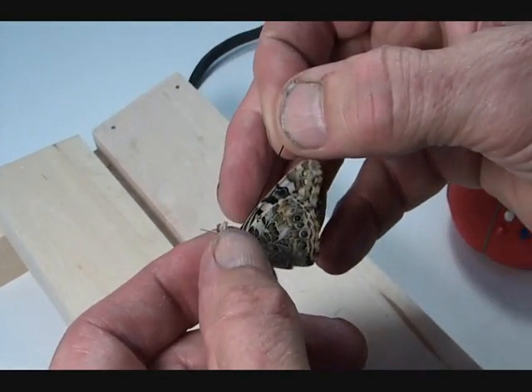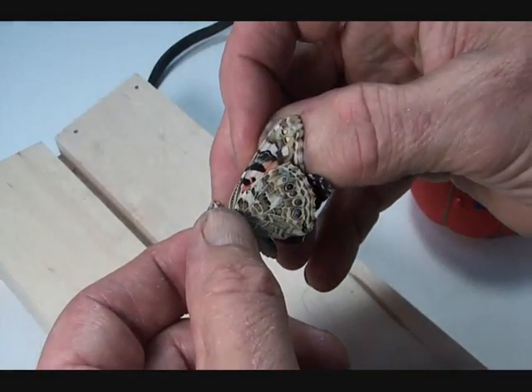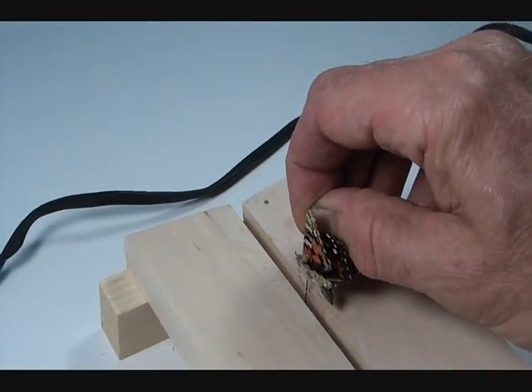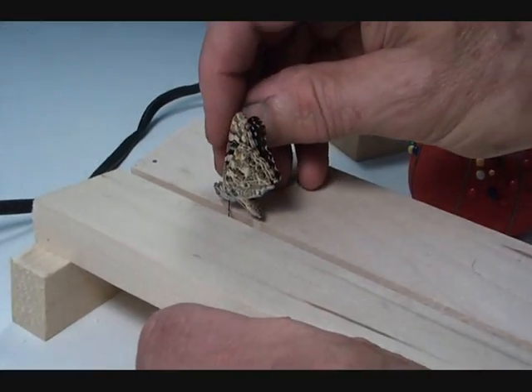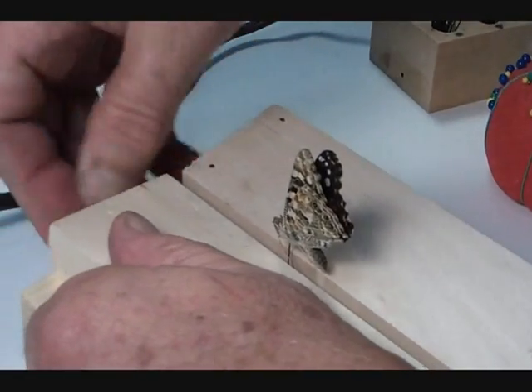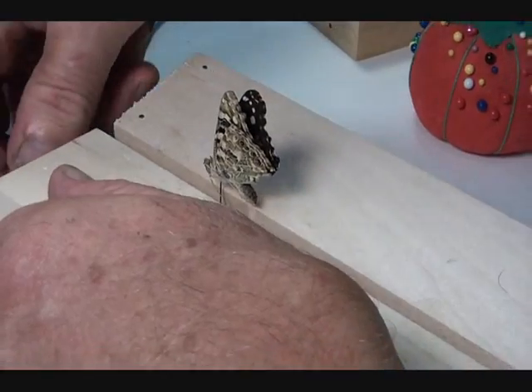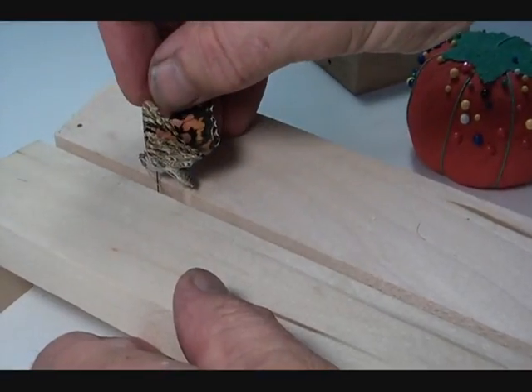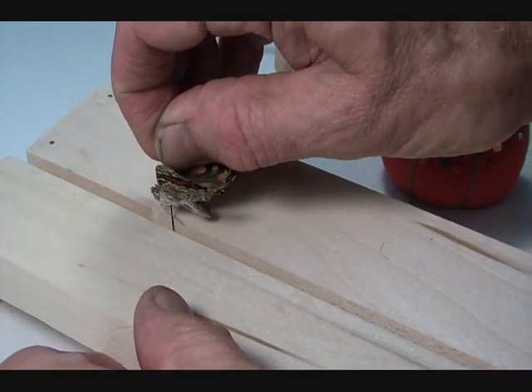Push the pin through until you've got about that much showing. Then bring it to your spreading board and pick a gap that is going to fit the body down into it. I've set up this spreading board so it's narrower at one end and a little wider at the other, so I can select the right groove size — I think right about here is about the right groove size.